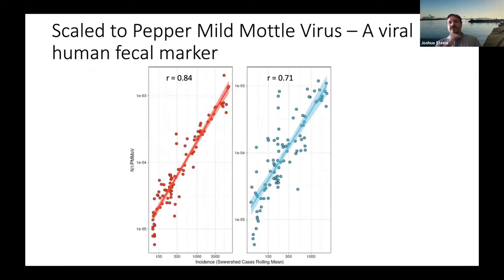One other thing that we did, because there is some noise in the data, and as you might imagine, sewage is not a constant mixture. It can change during times of the day, can change during times of the year. We're not interested in tracking false patterns where maybe suddenly it's more dilute because there's more water in the sewage and less human fecal material.